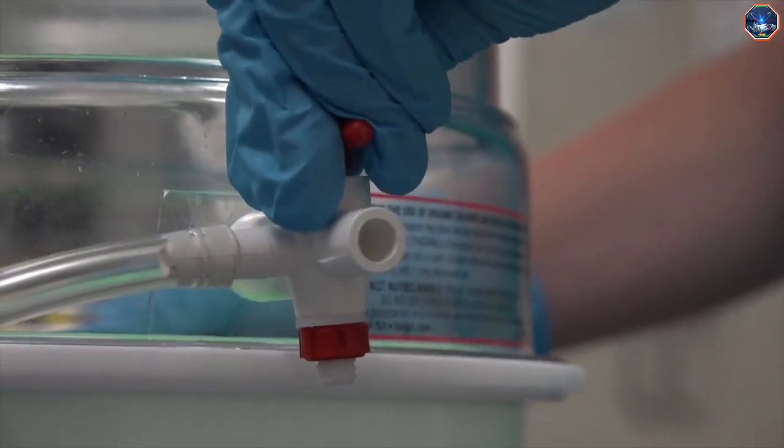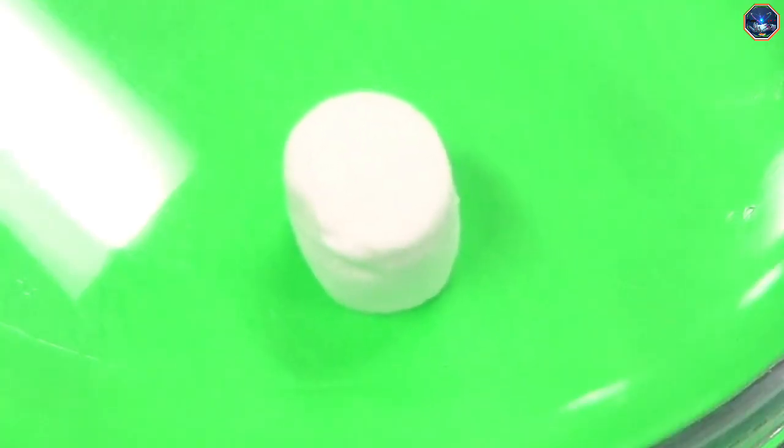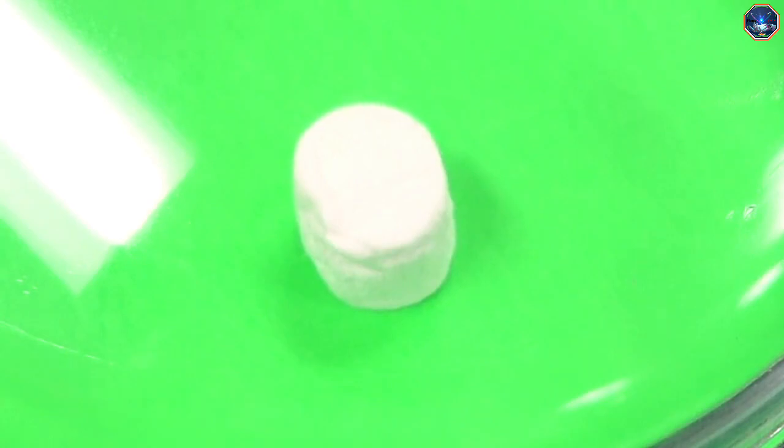Okay, let's turn off the pump and we will now let air back into the chamber. As we go from vacuum to atmospheric pressure, the marshmallow collapses.